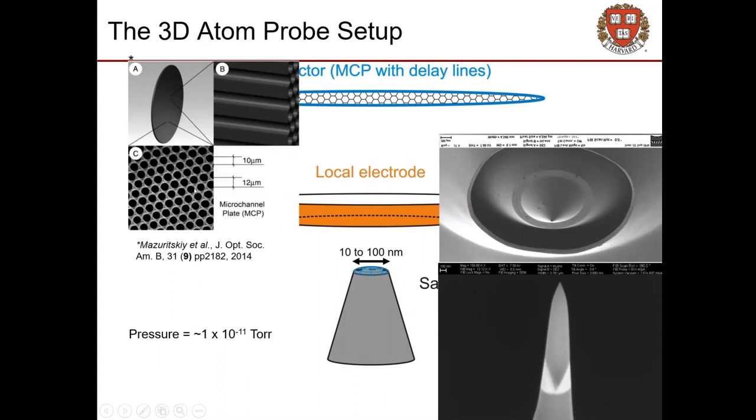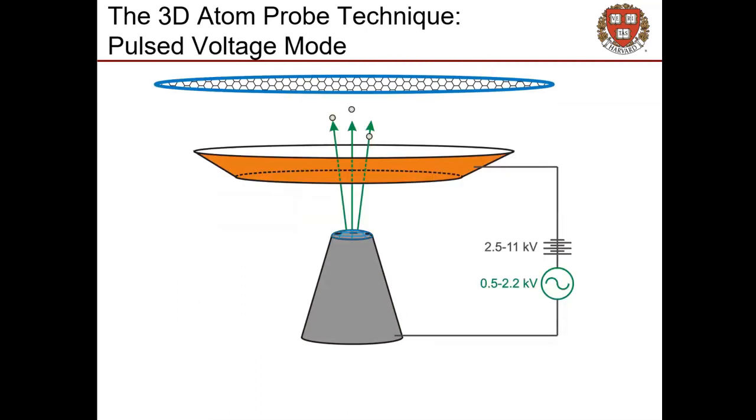Ions or photons that strike within those channels are recorded. Anything that strikes the area between those channels is not. So that's the hardware. Well and good. What do we do with it? So here's what we do.